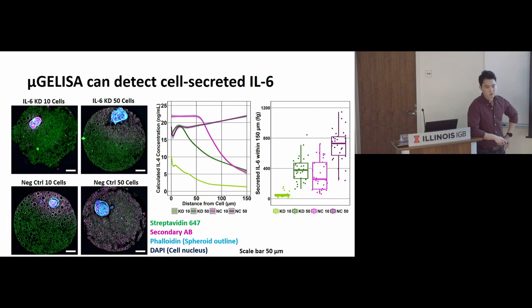So it's very similar to all the processes that you would do in immunostaining. Of course, you do require longer wash steps because they're in a micro well, they're kind of stuck there. But with diffusion, it does come out. You do see some sunk down on the bottom, maybe if they aggregate. But in most cases, you'll be able to see clear-cut fluorescence around. You'll wash them out.